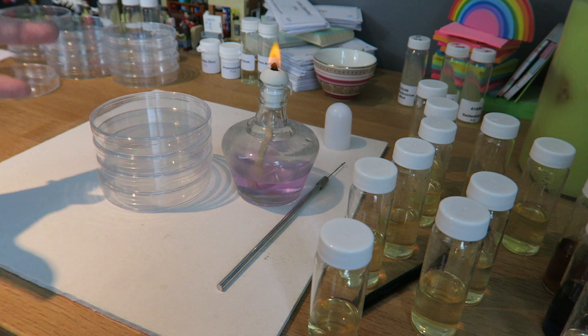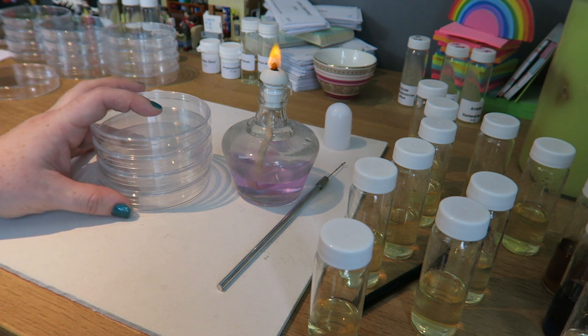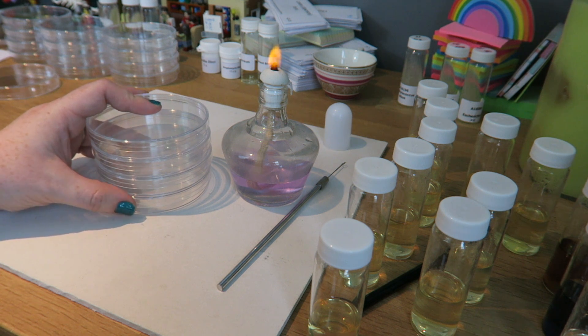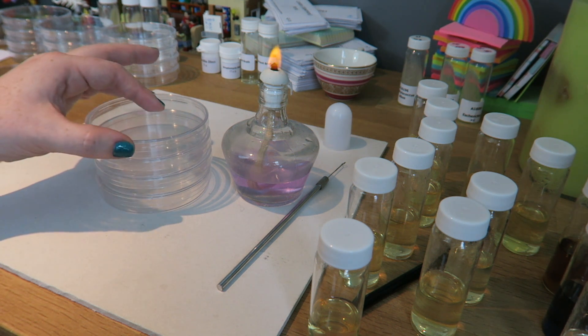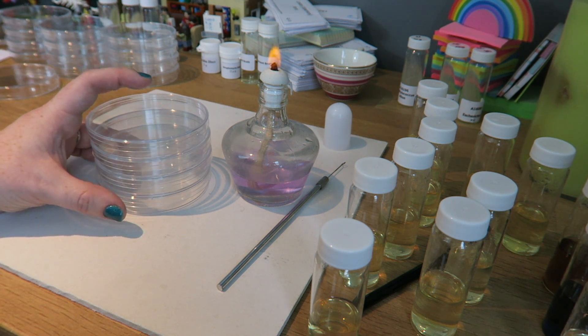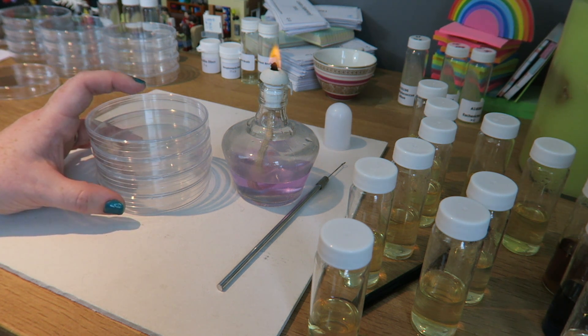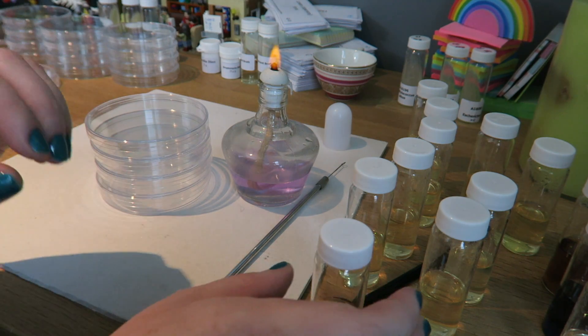When you're pouring agar plates, if you're gonna pour a lot of them, it's a good idea to have a stack about the size so that you can comfortably hold the whole lot in your hand, because you're gonna be taking the lid off, lid off, lid off. For me, that's four plates — you might be able to do five or six plates, but it's better to have less plates so that you don't drop them, because then you have to start all over again.